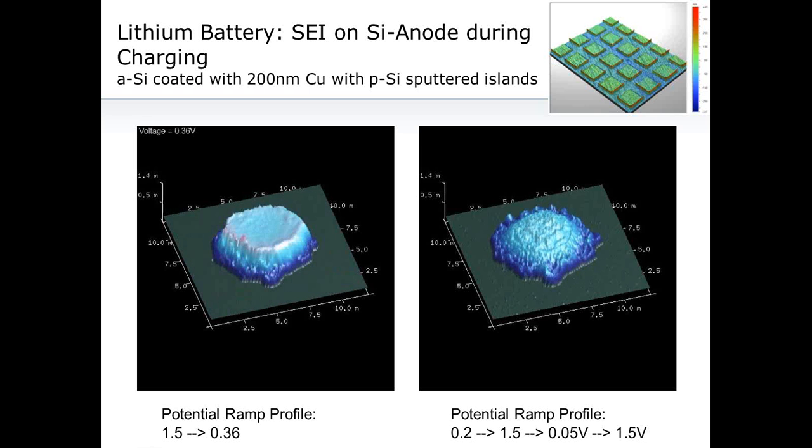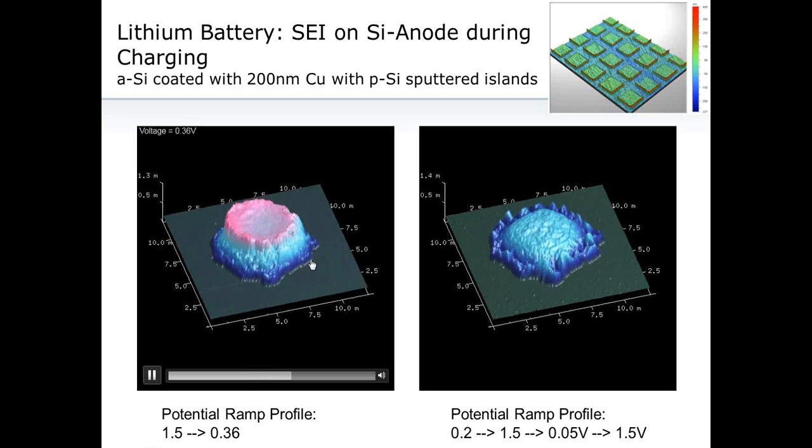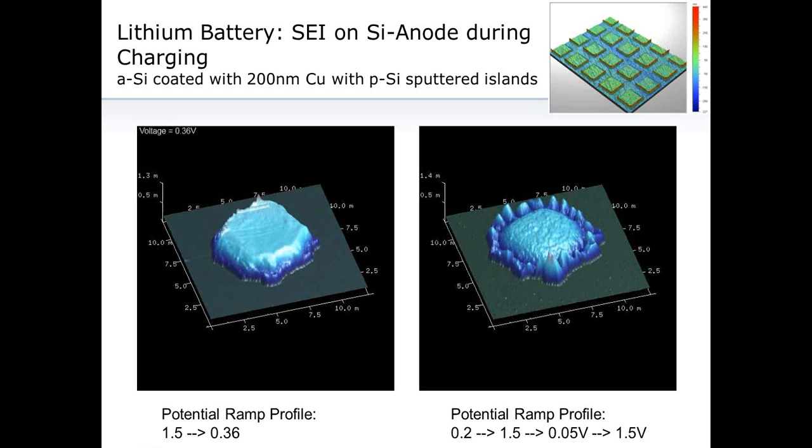When you charge a lithium battery, probably you are very familiar with lithium batteries. In your laptop, in your cell phone, there's a battery that powers up the devices. That battery is a lithium battery for its high energy. Now, if you wonder what's happening on the surface when you charge or discharge, what you can do is use AFM: you approach the surface, and while the charging and discharging is going on, you see what's happening on the surface.